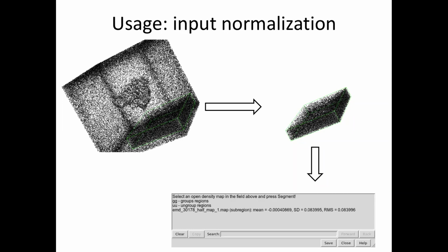I guess that's kind of a follow-up to that: how do you know if the noise in your map is following the same distribution as the noise in the training set? And I apologize if this is not going to be a fully coherent follow-up question, but if there's something wrong with your data, where experimentally it's just skewed in some way and the data set is broken, is that something you're going to be able to detect with the noise comparison?